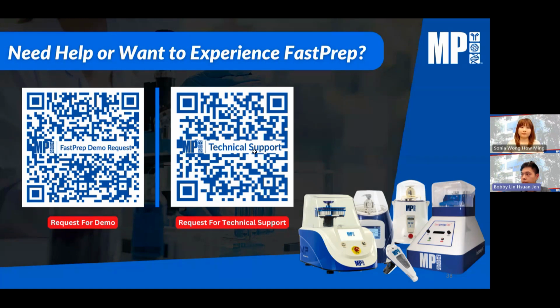Okay, let's see. We have Gazel. Thank you for the question. He's saying that I have groundwater sample, which is very oily and dense. What kind of lysing matrix should I use for them? I think typically for oily samples, especially in water, we use lysing matrix E. But of course, one of our kits, the Spin Easy kit for water, utilizes the filter membrane as well. So it's very important that we separate the oil and the water to essentially get a good yield and, of course, a good purity in this case.